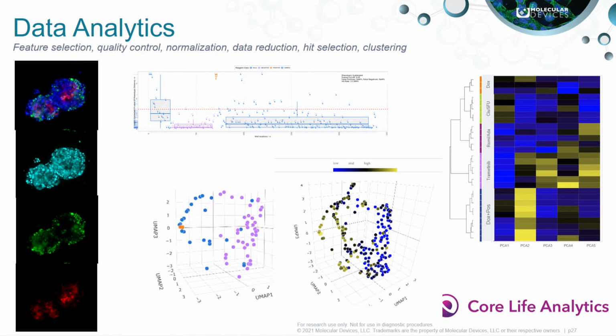And then here is the doxorubicin treatment, and you can see the ones applied at low concentration are closer to the DMSO control, whereas the ones that had high concentration of doxorubicin are closer to the positive control. On the right is the same thing, but looking at a heat map of the concentrations being used. And of course, you can also do clustering with this approach, and this is really nice when you have compounds with maybe unknown mechanisms of action. If they cluster together routinely, it gives you an idea of what the mechanisms of action are, and that can help you make more informed decisions later.